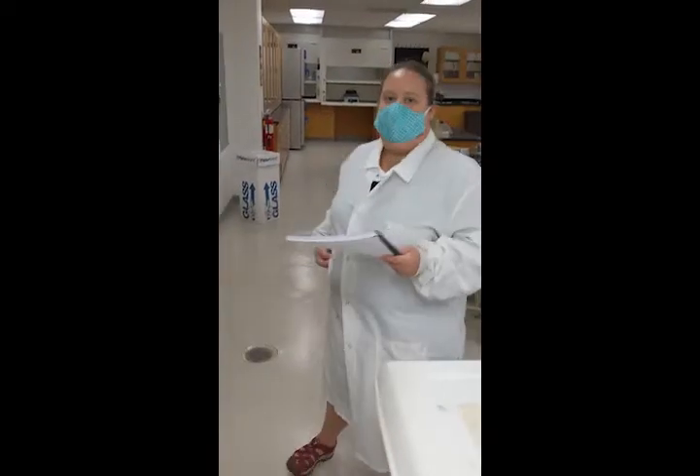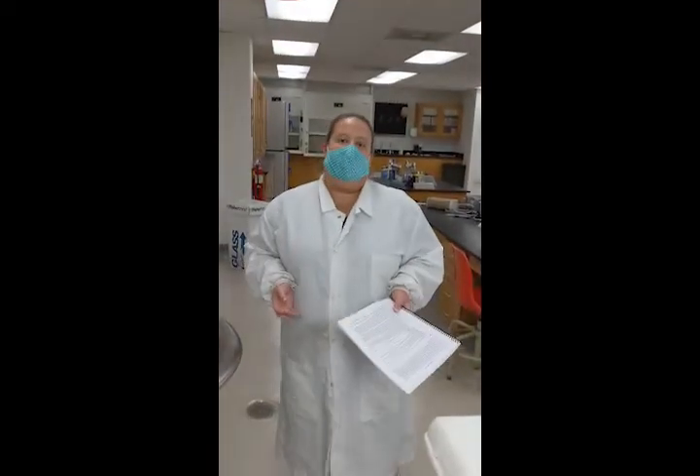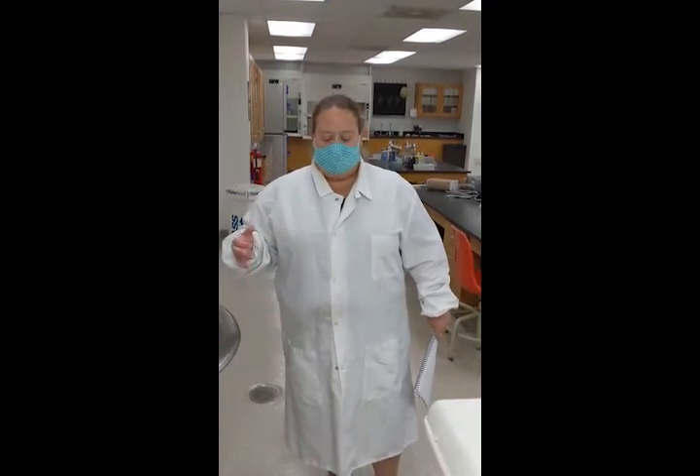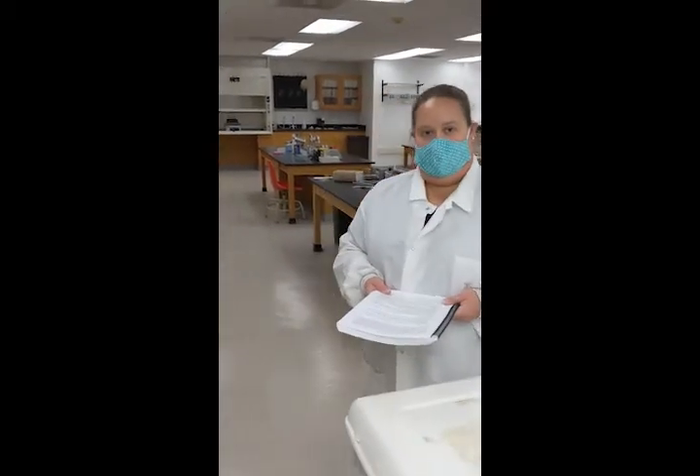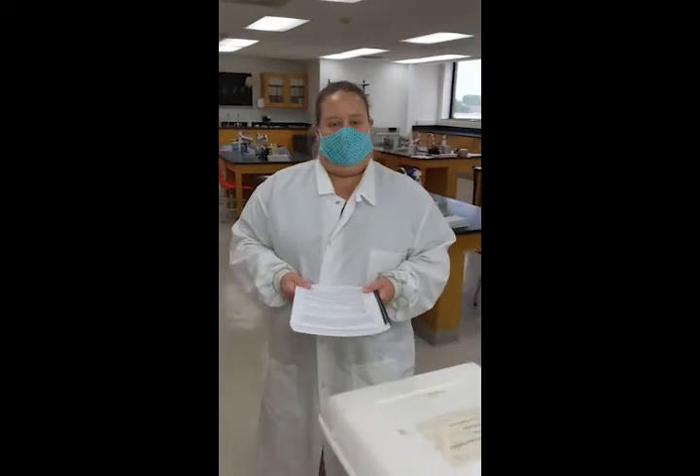You should also be wearing a lab coat when you come to the lab. This lab coat is going to help prevent you from staining your clothes, and it also allows microbes to fall on your lab coat, not on your street clothes. When you pipette, you should never pipette by mouth — we have pipette aids that will help you.